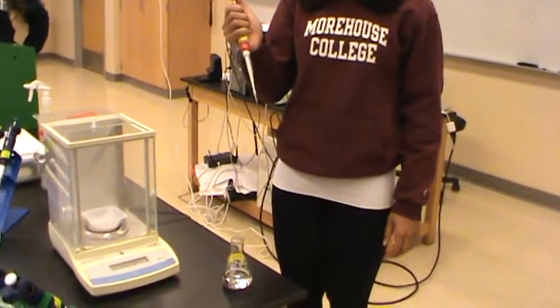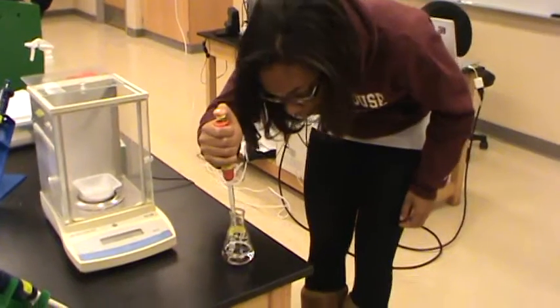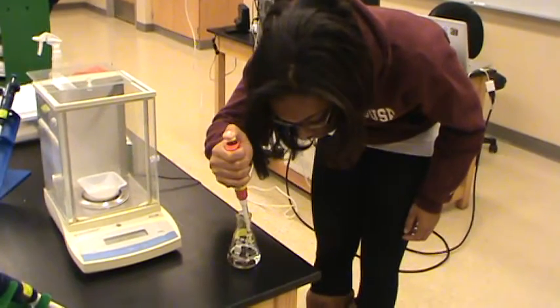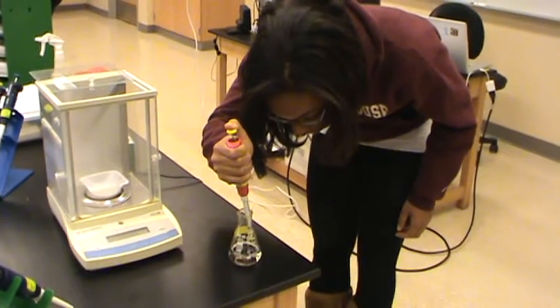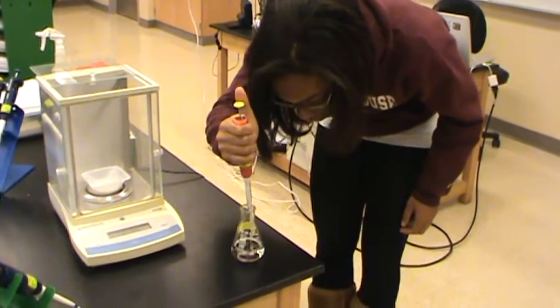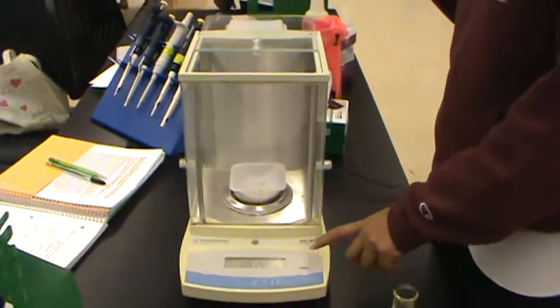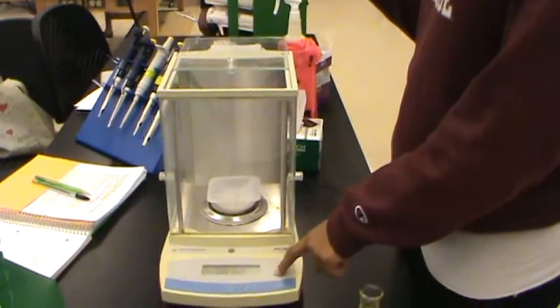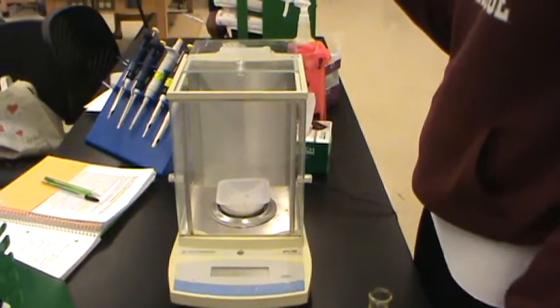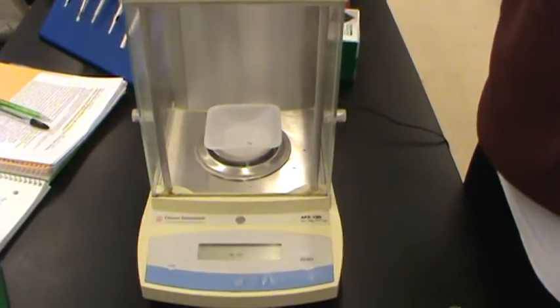Demonstrate taking 20 microliters of water: push the pipette to the first level and then slowly release it to take up 20 microliters of water. Then push the pipette all the way down to squeeze out the 20 microliters of water into the tray on the balance.